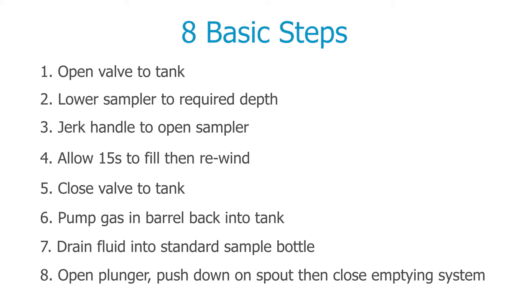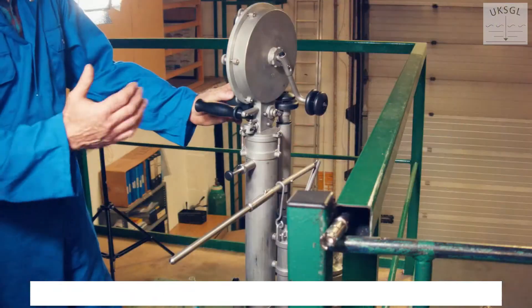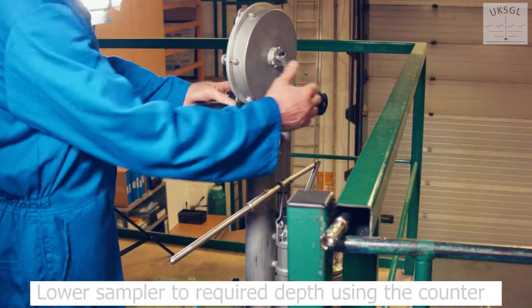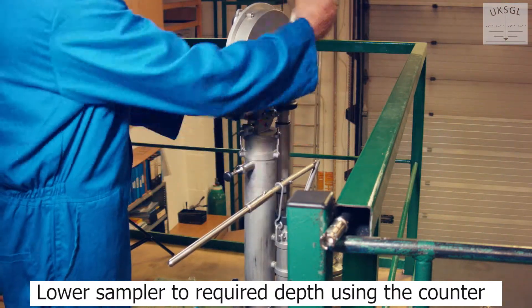This video will demonstrate how a spot sample is taken after attaching the MK17 winder. Open the valve to the tank, then lower the sampler to the required depth using the counter.